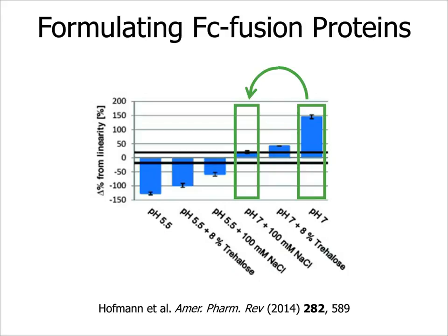And when they screened their different proteins in this mechanism, it took them very little time. It was a simple 3-minute experiment that they did. And this correlated with their long-term turbidity experiments, indicating that this was for them a good way of predicting their protein stability.